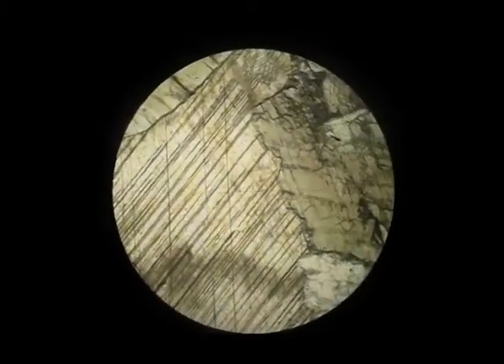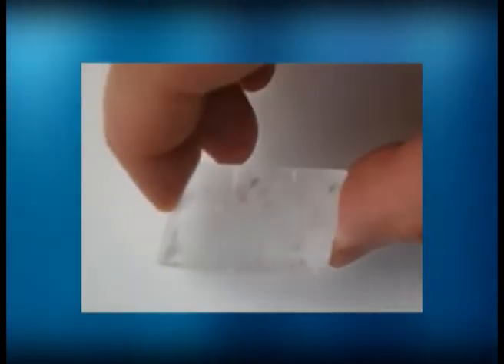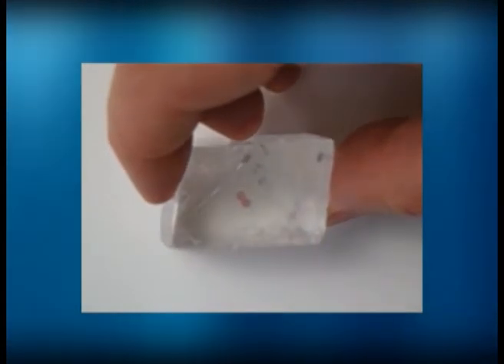The difference between the two refractive index values is known as the birefringence. This is best seen in doubly refracting minerals like calcite, where the refractive index in the C-axis direction is 1.4864. Light vibrating in this direction is known as the extraordinary ray or E ray, and in the direction of the A axis the refractive index is 1.6585. Light vibrating in this direction is known as the ordinary ray or O ray.